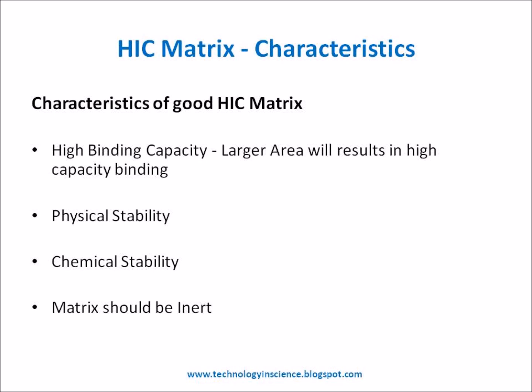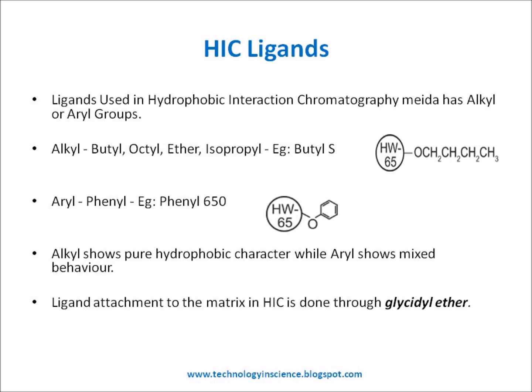Hydrophobic interaction chromatography ligands. Ligands used in hydrophobic interaction chromatography media have alkyl or aryl groups. Alkyl shows pure hydrophobic character, while aryl shows mixed behavior. Ligand attachment to the matrix in hydrophobic interaction chromatography is done through glycidyl ether.